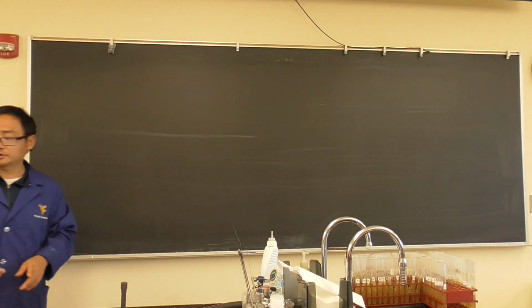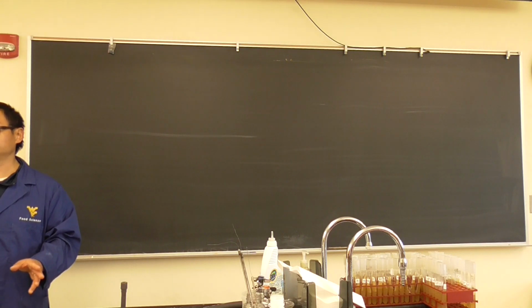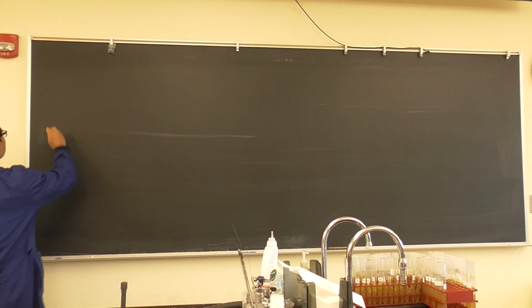Now let's talk about the results. Let's talk about the material. We will have 3 lab works today: 2 biochemistry tests, and 1 is pathogenic fungi. We will do the observation. Okay, so let's talk about biochemistry.